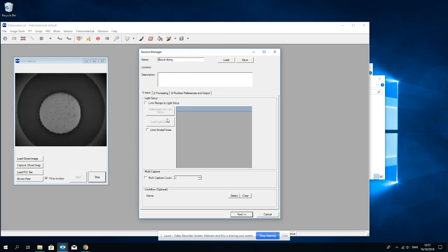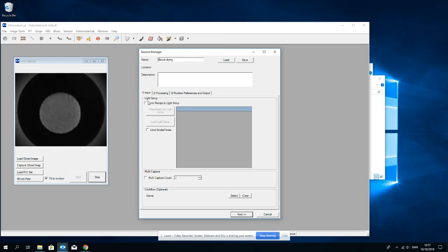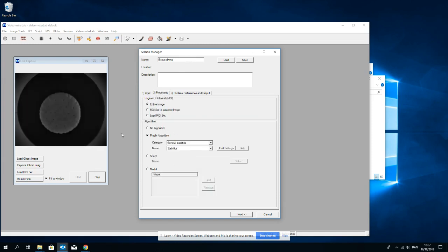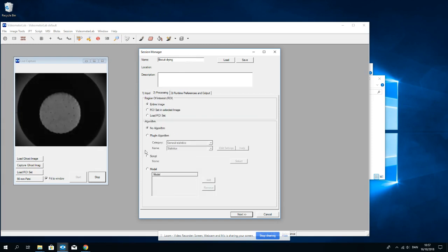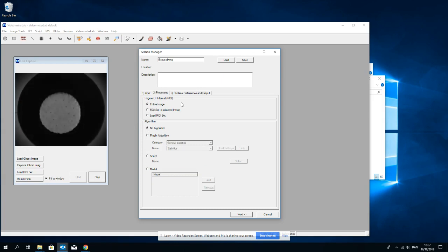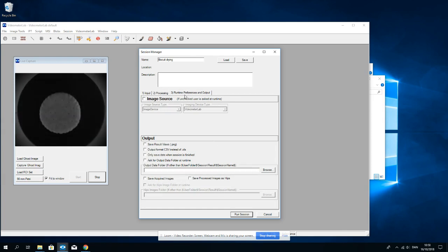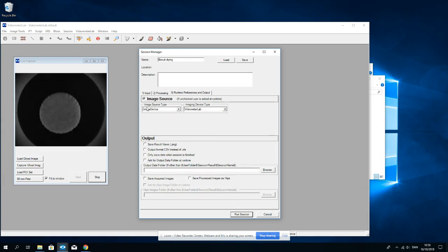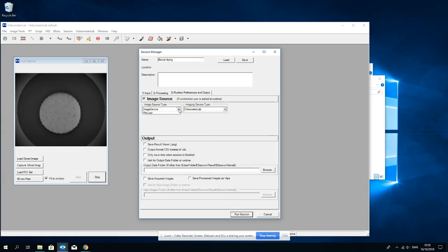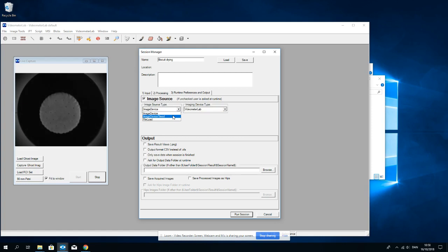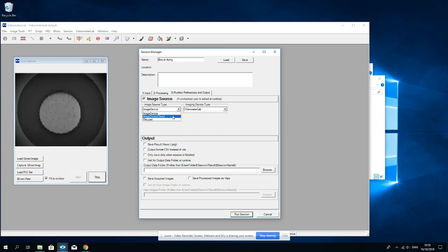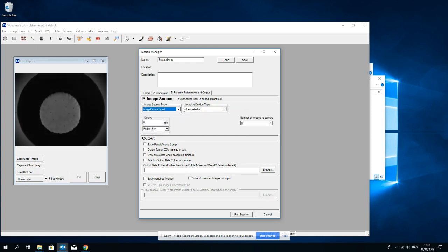Enforce a given light setup, but I don't want to do that at this point. I can also do some processing while I capture. I don't want to do that. I choose no algorithm. I just want to capture the images and runtime preferences and output are chosen to be imaging device time capture from Videometer Lab.